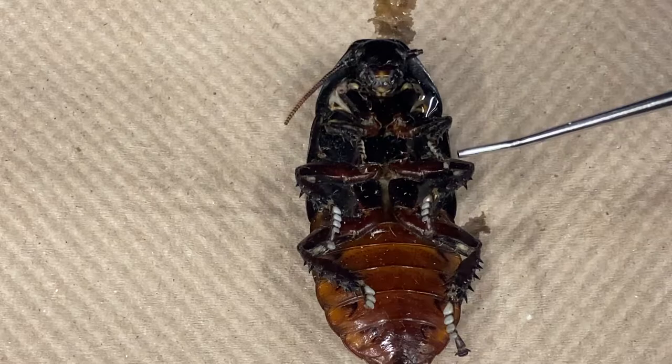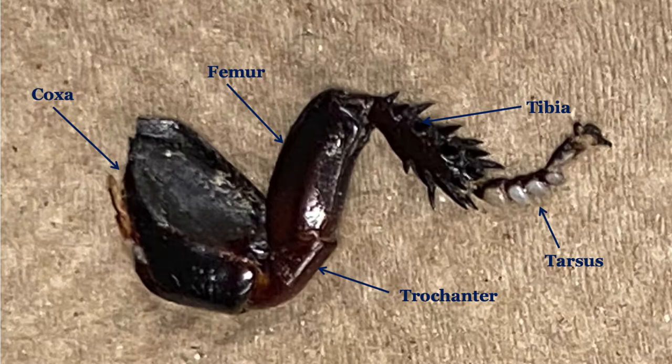There are three pairs of jointed legs, one on each of the three segments of the thorax. Taking a closer look at one of the legs, you can see the various distinct parts that give the cockroach its great climbing ability, including on smooth surfaces.